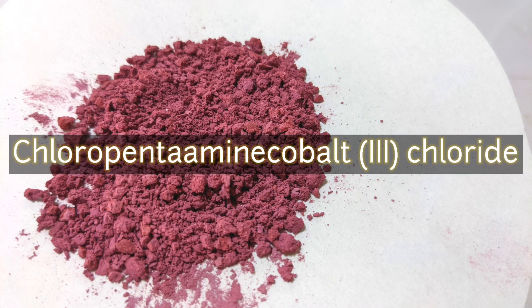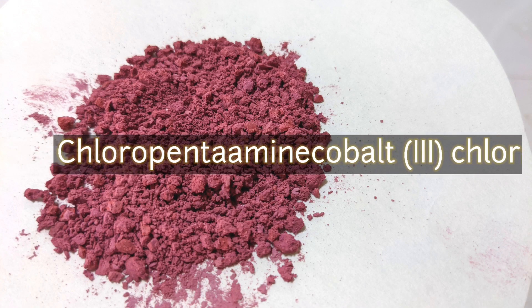Hello friends, in this video we will make the complex chloropentaamine cobalt-3 chloride.